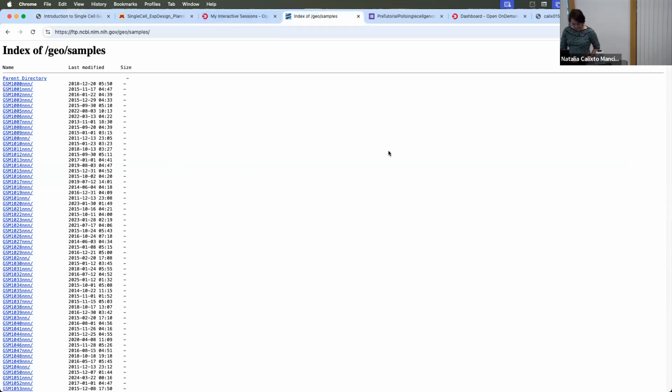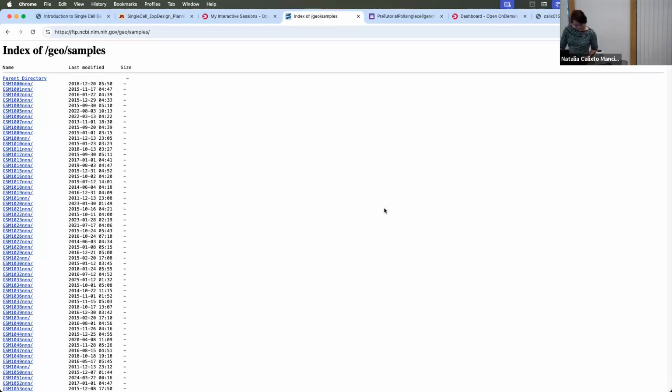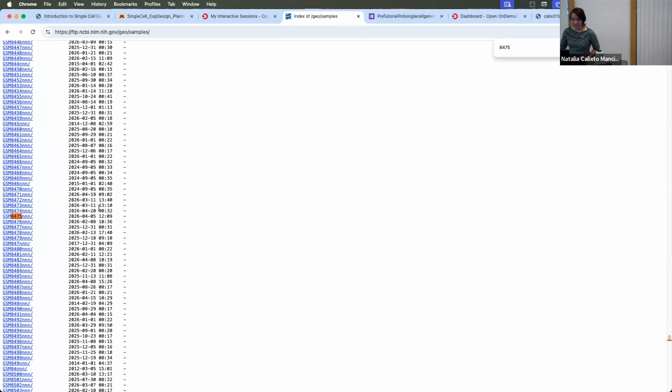Let's look for the number, 8475. Here is another folder. Click there.